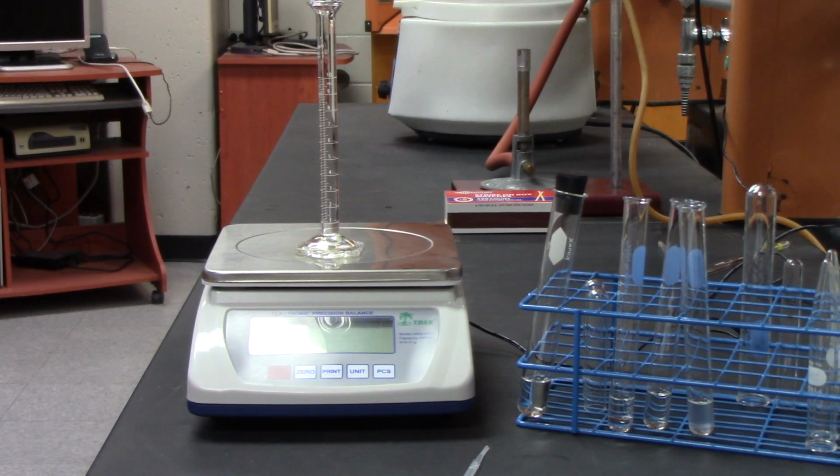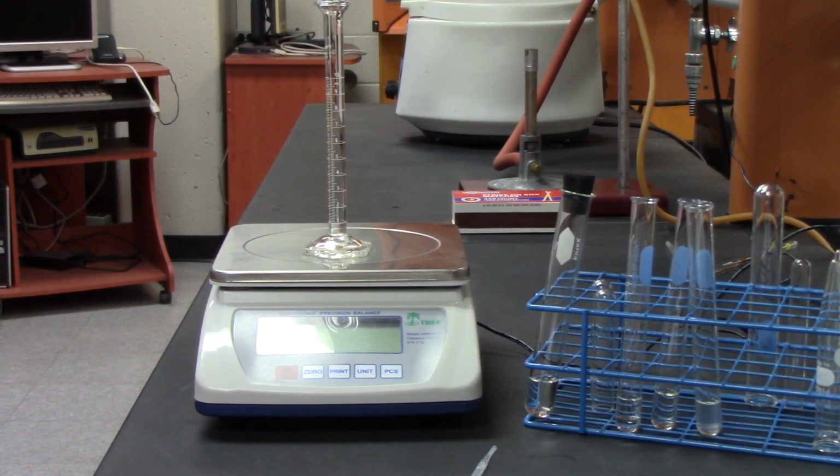Any graduated cylinder, any kind of graduated scale, you always allow one more digit than you can read, okay? So this measures to the tenths. So I'm allowed to go one more digit than I can actually read. So I'm going to record a number to the hundredth. Okay, and then we have our scale, our balance, which will weigh our liquid.